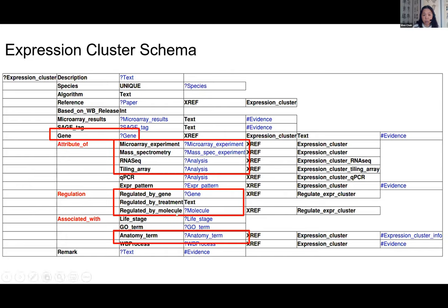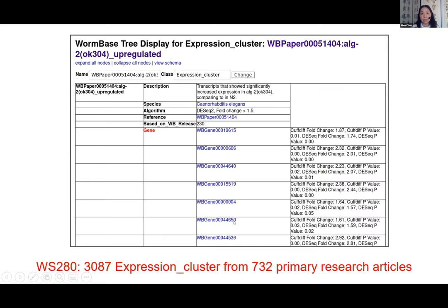Expression clusters can also capture drug response — genes regulated by molecular or chemical substances — and the tissue enrichment of gene lists, such as genes differentially expressed in the pharynx compared to whole animal. In WormBase, each expression cluster is a subject showing a list of genes, the species, and how they were regulated.